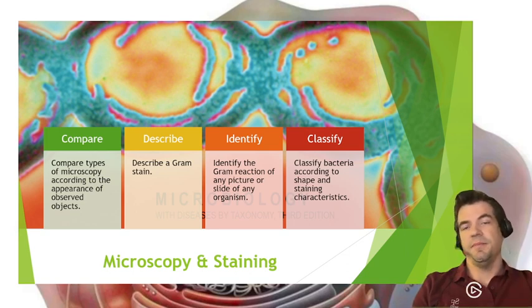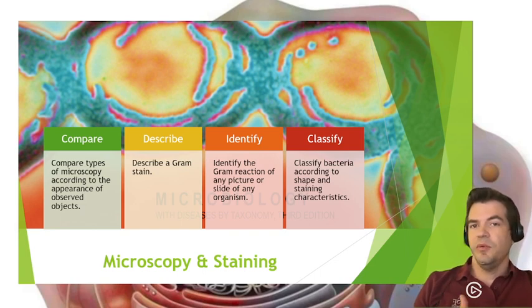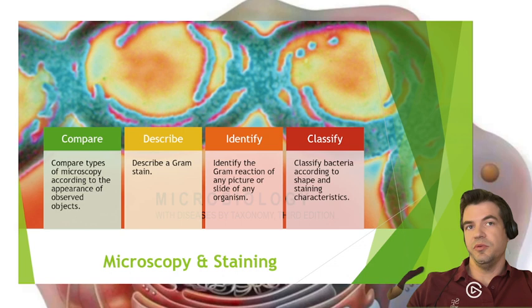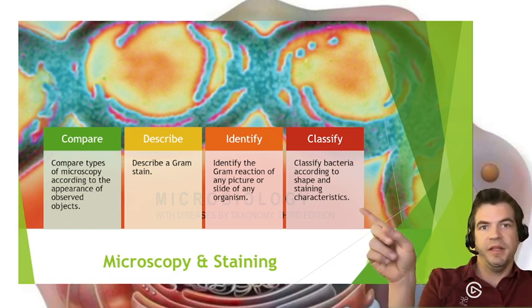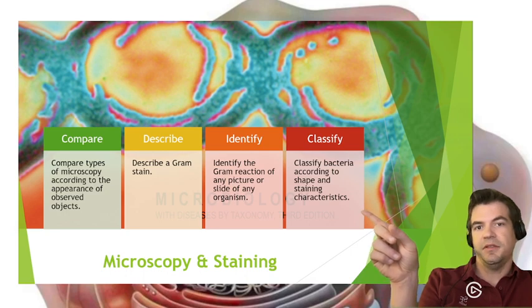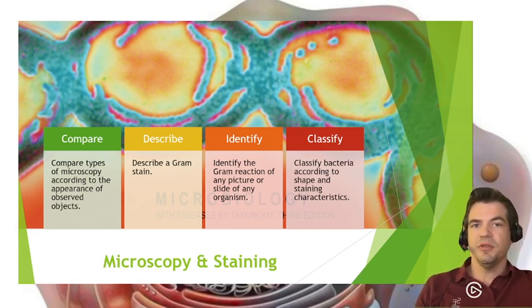So going right into it, we want to be able to do these objectives by the end of these videos. You should have already looked over this PowerPoint a little bit to clue you in on what to expect here. I've also gone over the mnemonics for gram stain, the purple positive, pink negative with the N, but we will see a few more things.